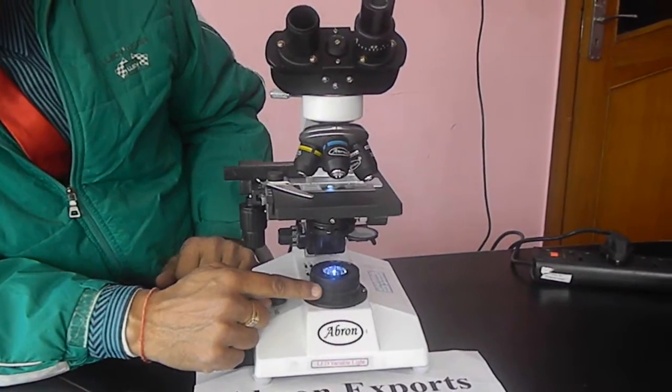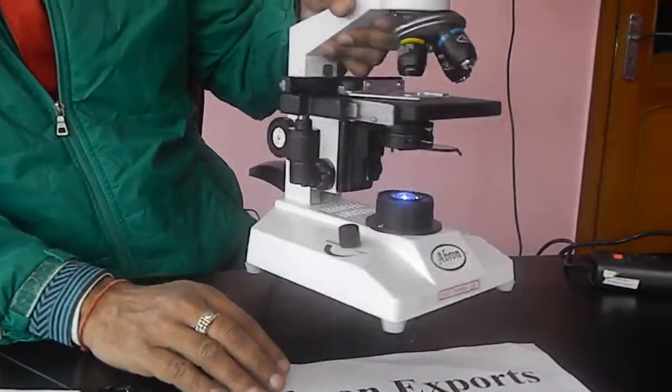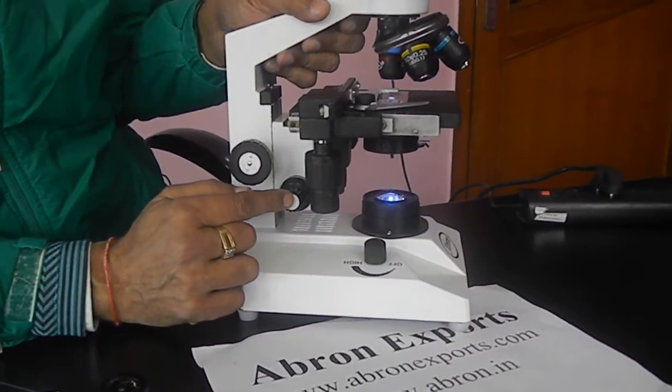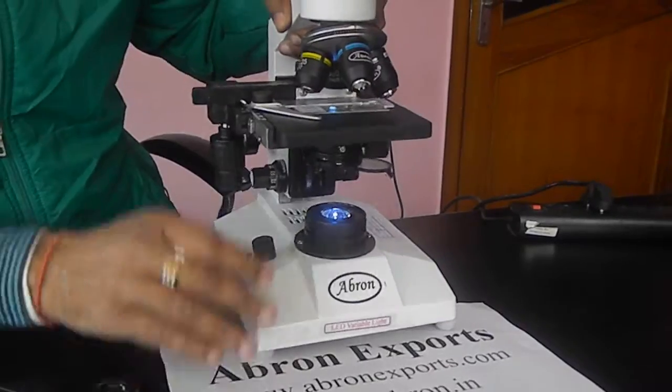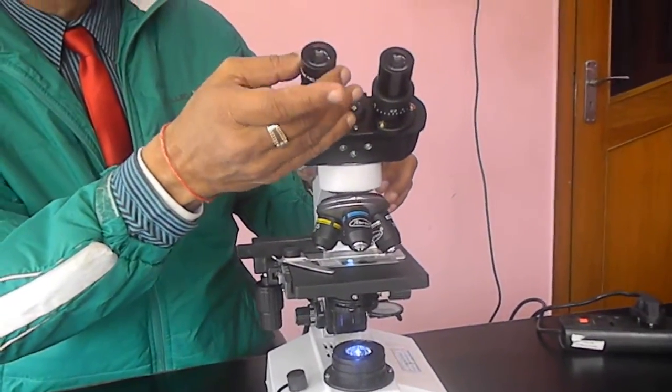Then there is condenser light given here and there is one focusing knob. This is coarse focusing, this is fine focusing. And there are two eyepieces, wide field eyepieces to be placed inside.